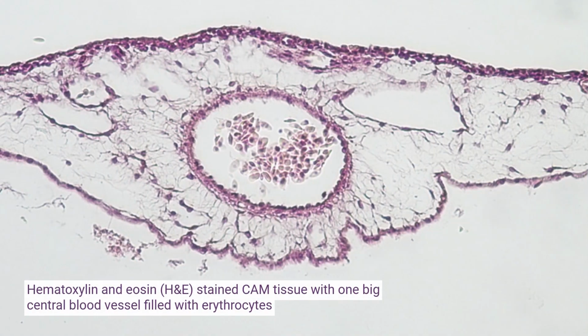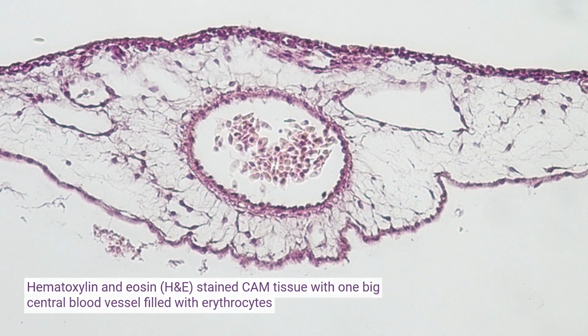Well, of course, a classical way to do this is to dissect a tumor or also a biomaterial and do some immunohistochemistry. There we can fix it and stain it. But the problem with tissues from the CAM is that we really have limited access to antibodies that work in chicken tissue. So often we have problems assessing the blood vessels or other markers in this tissue by immunohistochemistry because many antibodies do not function in chicken tissue.